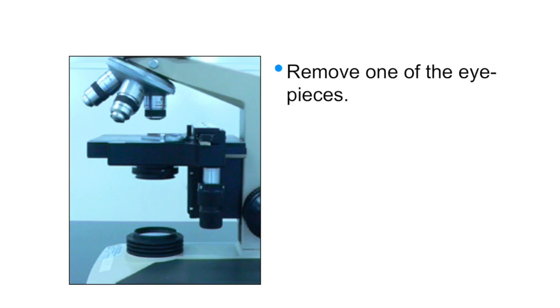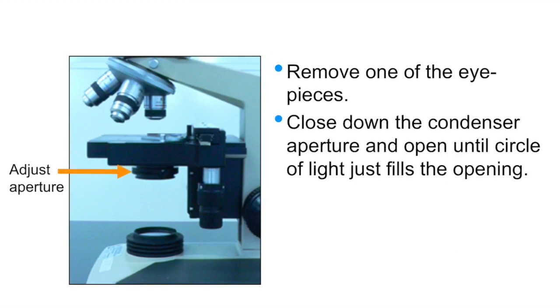We then remove one of the eyepieces, and looking down the open barrel, we adjust the height of the aperture on the condenser until it just fills the inside of the barrel. Having done that, we should then produce a column of light, as shown here, which is both centered and focused on the specimen.